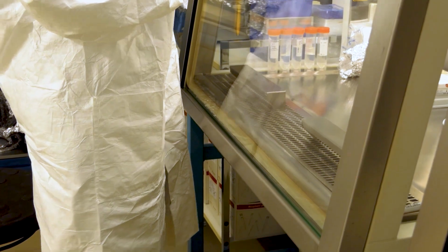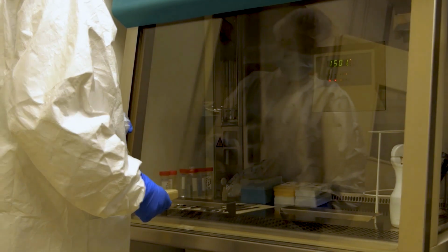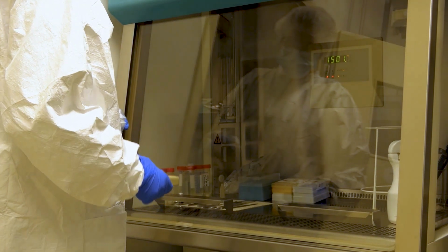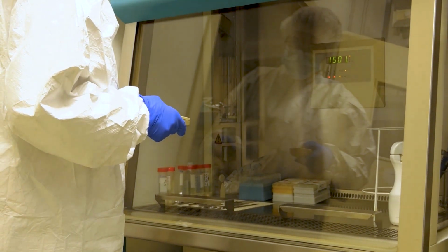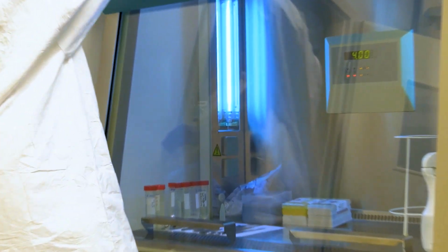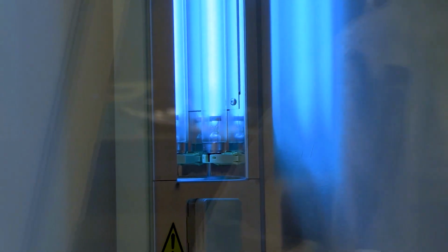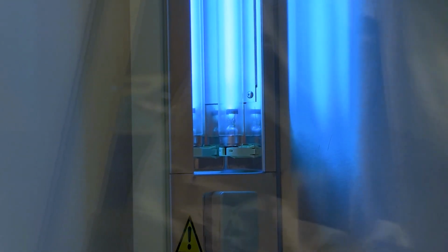After finishing the project, also clean the floor of the rooms in which you worked with bleach, chlorine in addition. This will ensure future projects not to be contaminated by previous projects. Finally, before leaving the rooms, switch on the UV light and ensure radiation of 4 hours.